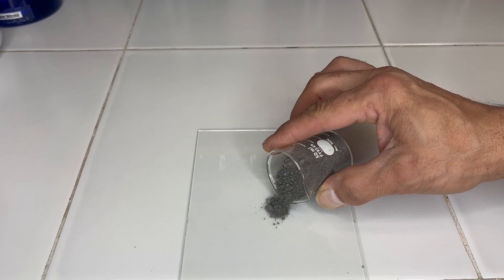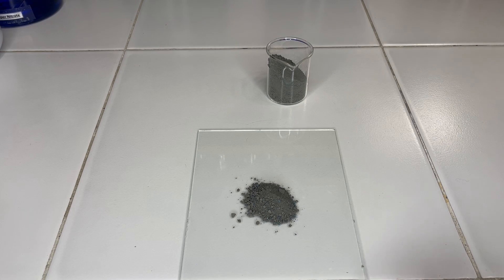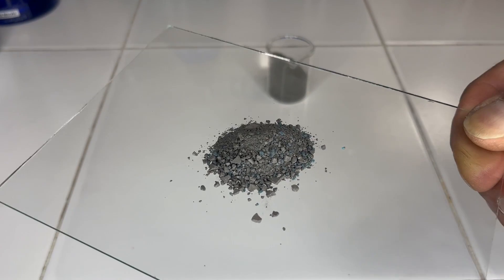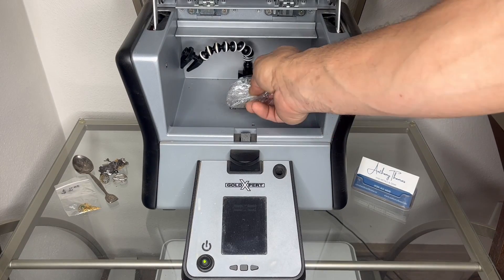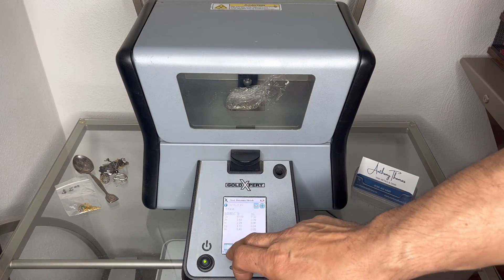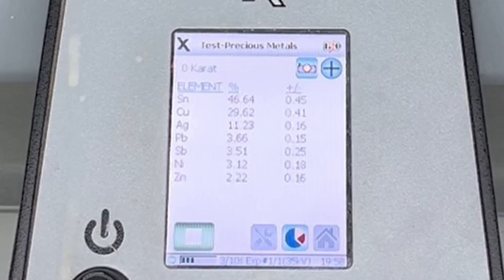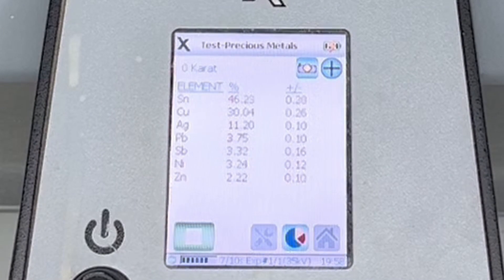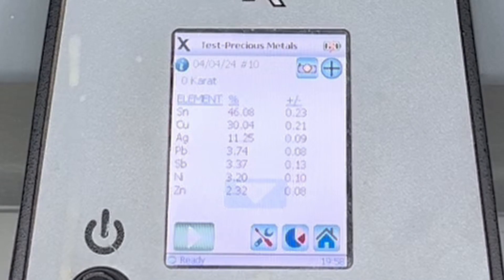Next, I rinsed and dried the copper cell slimes and got those into a piece of cellophane to get them tested in the XRF. When we started, our silver concentration was about 2.7% and the nickel concentration was about 4.14%. Now our silver content has gone up to 11% — I've had some as high as 13% after a first run. I also noticed the nickel concentration has dropped, so what we're finding is the majority of the silver is staying in the aspirator bottle, while the majority of the nickel is going over into the collection beaker, or in this case the fish tank.